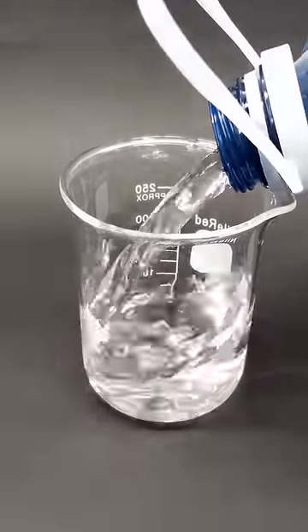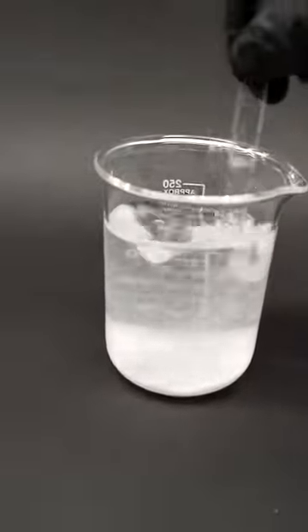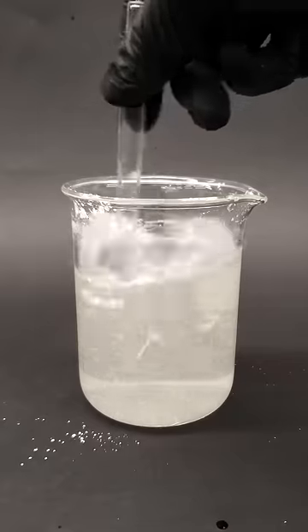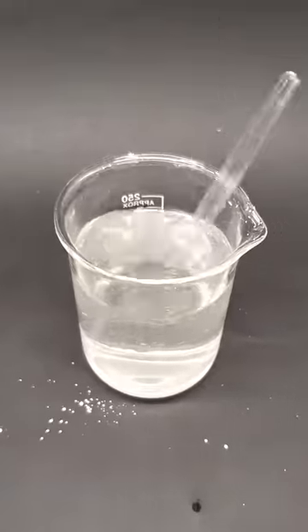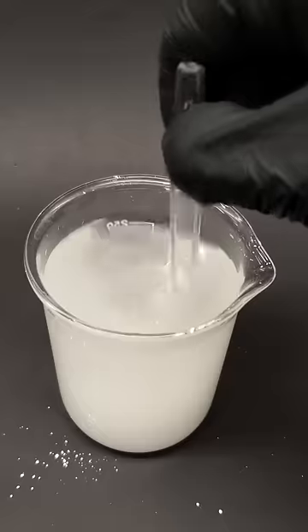To make this happen, I just have to add water to a beaker and a decent amount of sodium carbonate. Then I can add the luminol, which can dissolve in this solution. I also need to add some sodium bicarbonate, and this solution is basically ready.